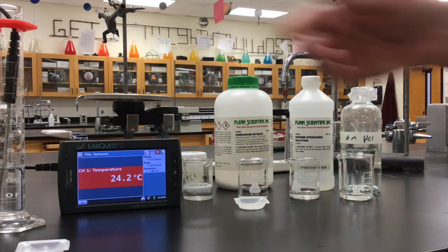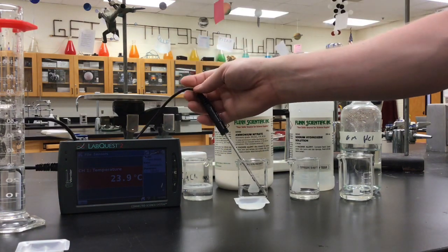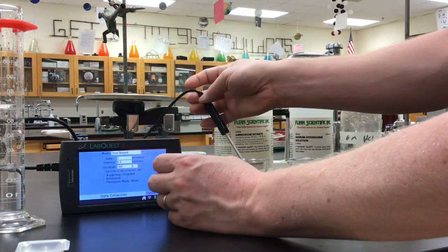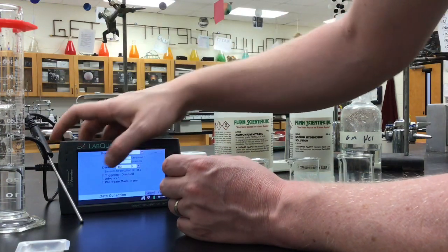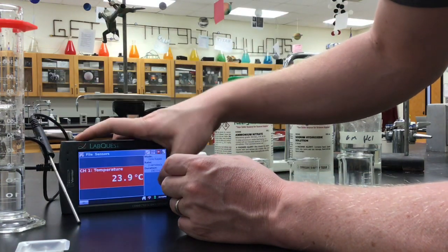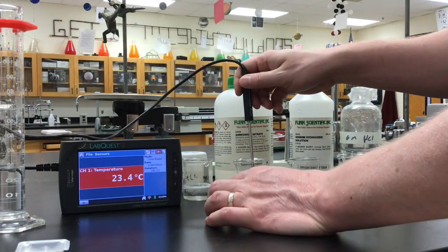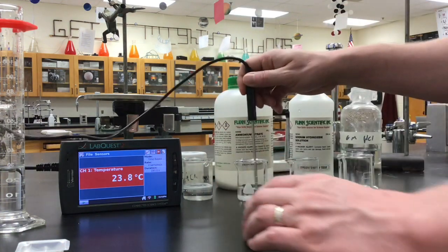Next, we're going to do ammonium nitrate. We're going to put our thermometer into our 20 milliliters of water, so we're monitoring the temperature. We're going to go ahead and put our ammonium nitrate into the beaker. Watch what the temperature does.